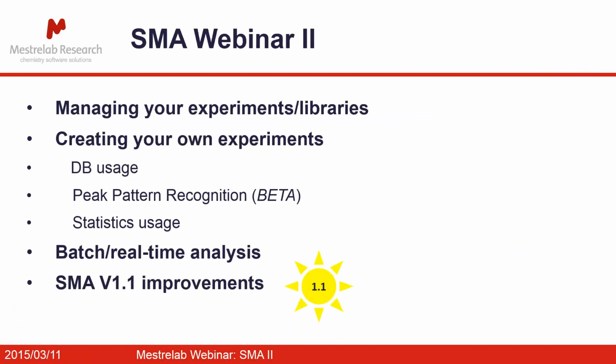Okay, so this is the agenda for today's webinar, Webinar 2. We're going to talk about the way in which you can manage your experiments in libraries, how this is done, very easy, how you can create your own experiments using standard input or integrating with your Mnova database, should you have that. I'll describe to you this peak pattern recognition, PPR capability. It's not in full production at the moment, so I'll show you a quite simple example of that.